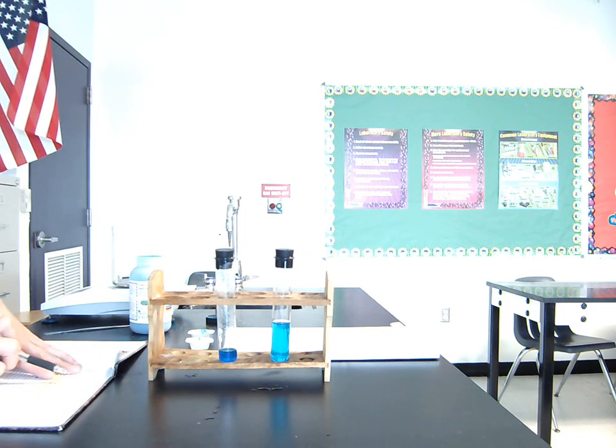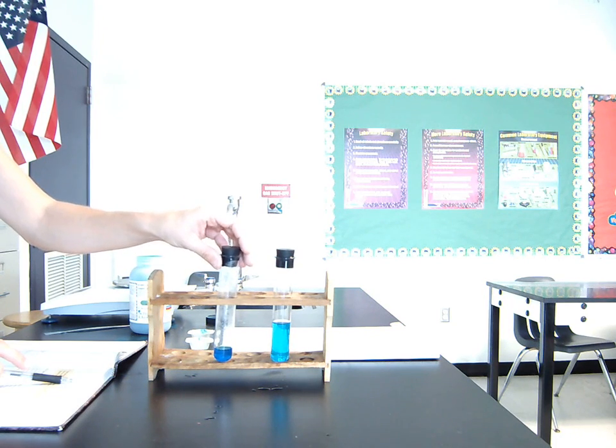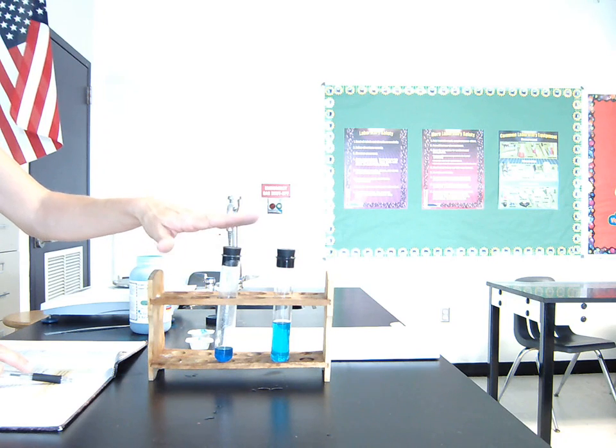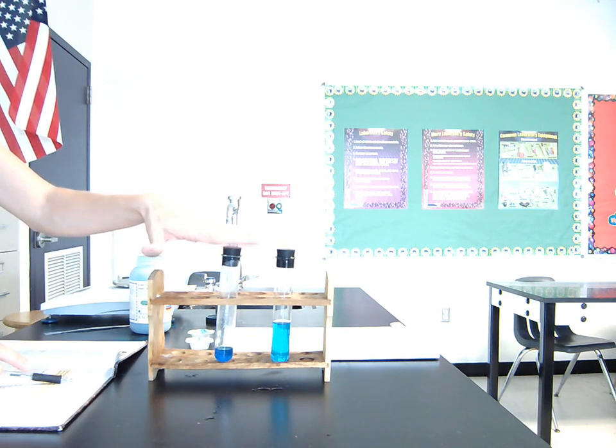Okay, last part. The only sentence at the top of 73, it says, a solution in which no more solid can be dissolved is called a saturated solution. So this is a saturated solution, the 5 cubic centimeter one. This one is not. The physical evidence that we have is that there is solid that is left undissolved. That's how I know that no more will dissolve. When I can physically see that no more will dissolve, that's how I know it's saturated.